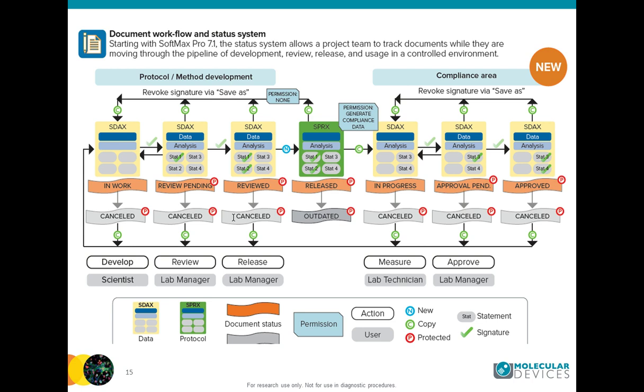Okay, great, thank you. All right, your next question is, has Molecular Devices consulted EU GMP compliance and not just FDA compliance? For example, EU Annex 11 and 15, MHRA data integrity guidance, or is the system and qualification services only designed to be US and not EU compliant?